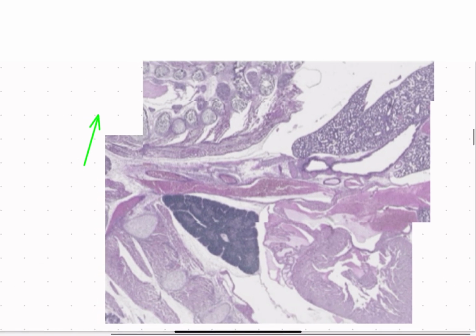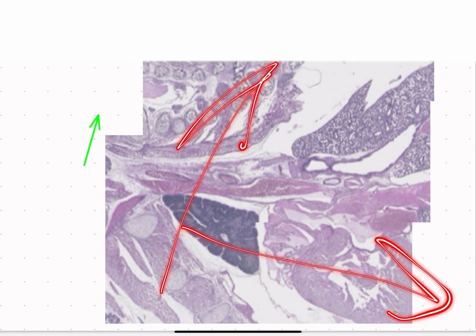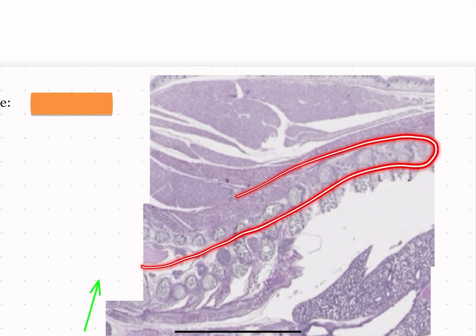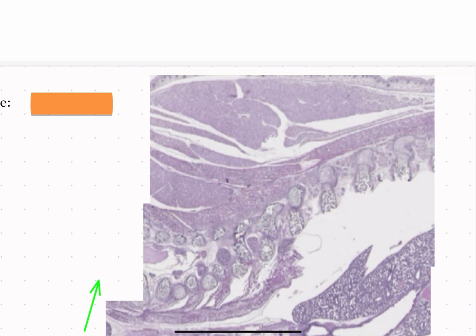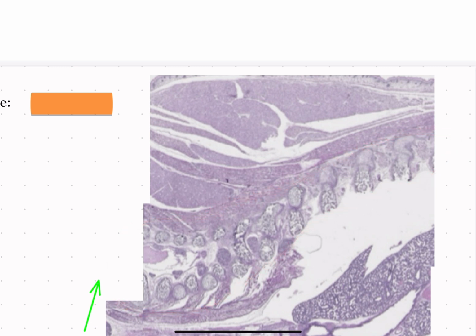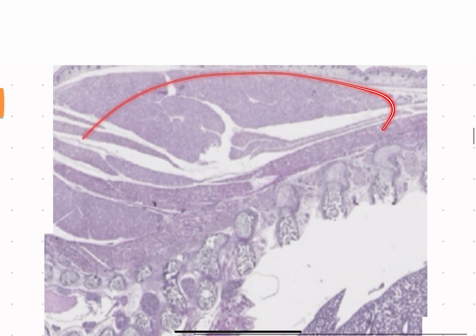2.2, the same slide again, but now we're going up, not towards the right. And we see this. If you can recognize this as the developing vertebral column, you are on a good path, because again, this is very helpful and insightful for all remaining structures, right? But we're looking at the back of the vertebral column.